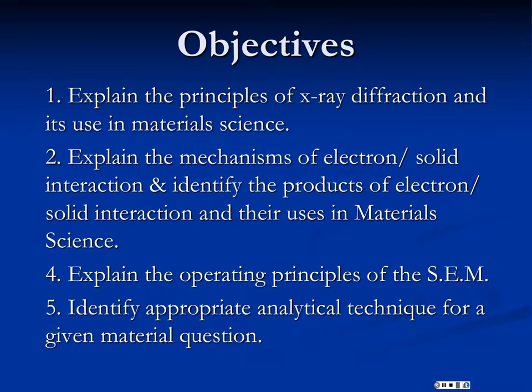So we want to talk about X-ray diffraction today, and we're going to spend quite a bit of time talking about the fundamental interactions of electrons and solids. Electrons are our friends in terms of analysis of materials. There's a lot of electron beam based instrumentation. We're not going to cover all of it.